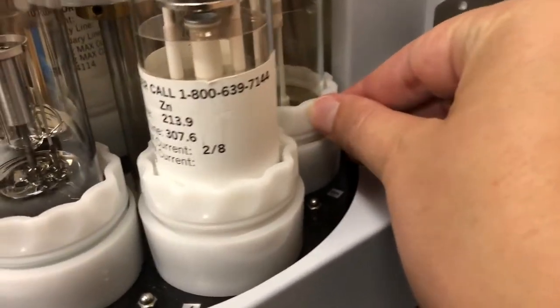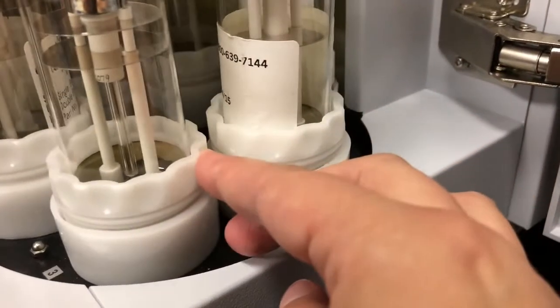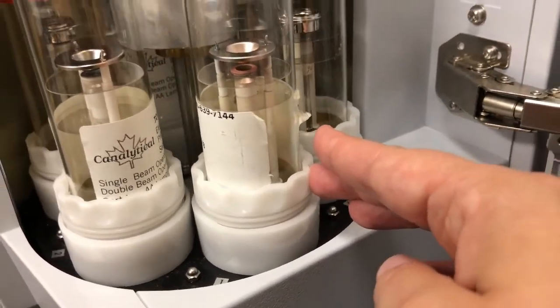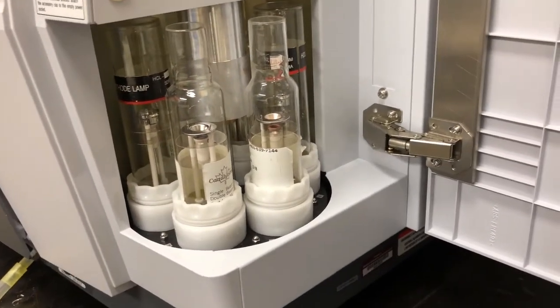If you look closer, you can see this one is for zinc, and we have various different ones depending on which element we're analyzing. And you can purchase these for pretty much all of the metals that we're going to be interested in.